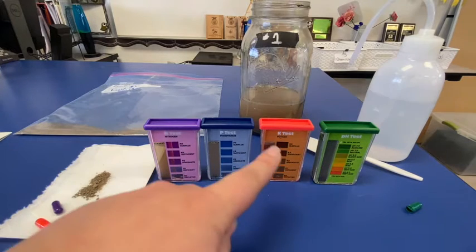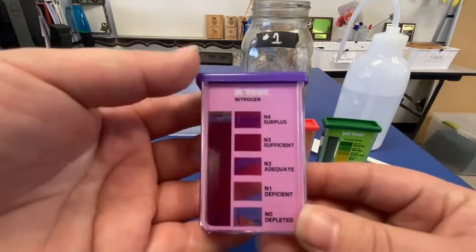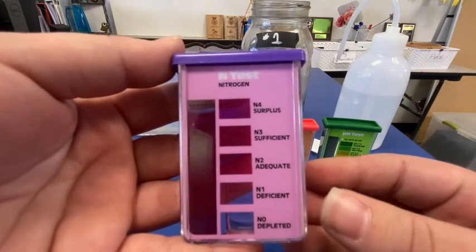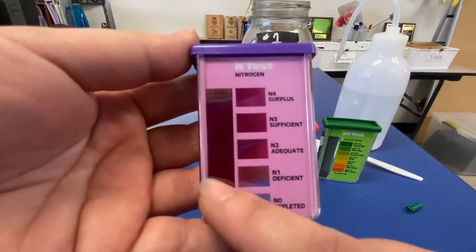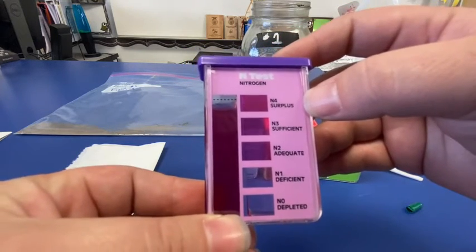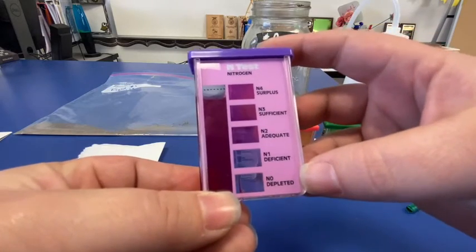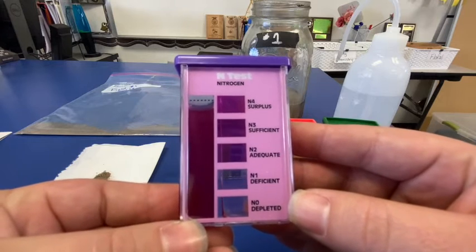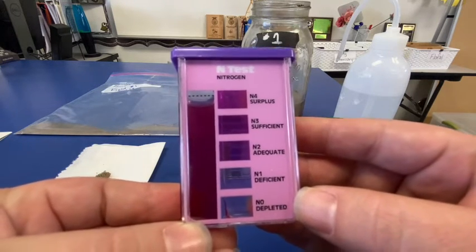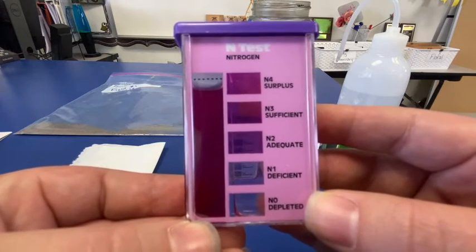For our nitrogen, phosphorus, and potassium, we're going to let those sit for 10 minutes. After the designated 10 minutes, as we can see on each of these indicators, there are different levels, and the color of what we tested will tell us what it is. For nitrogen, the categories are: N4 — surplus, N3 — sufficient, N2 — adequate, N1 — deficient, and N0 — depleted. Based on what we see here, we're going to see what color best matches and highlight that level on our slides. Feel free to pause the video at this time if you need to capture that down.